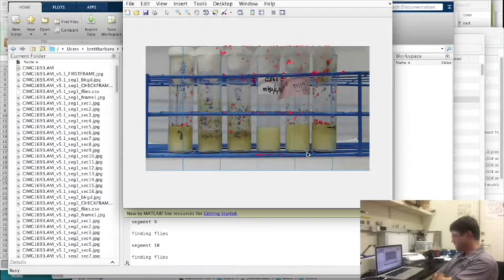Now, in this case, I turned off the lights. That was a major change. So when it did the evaluation of the entire video, it evaluated the overall luminance and brightness and everything.